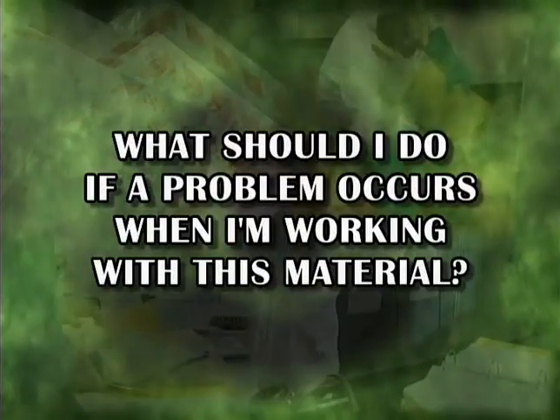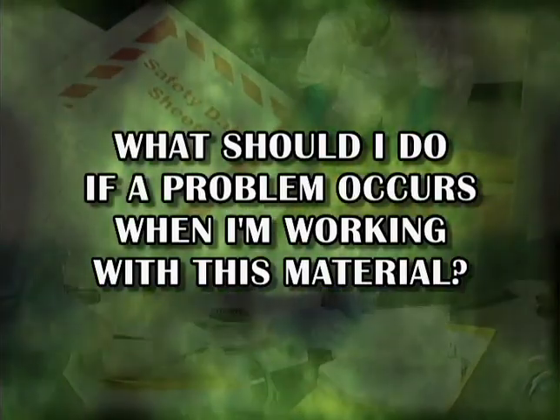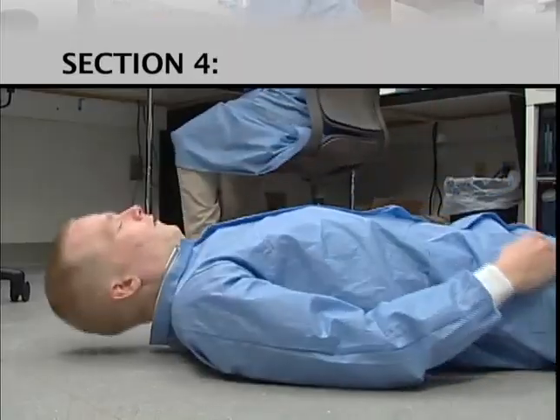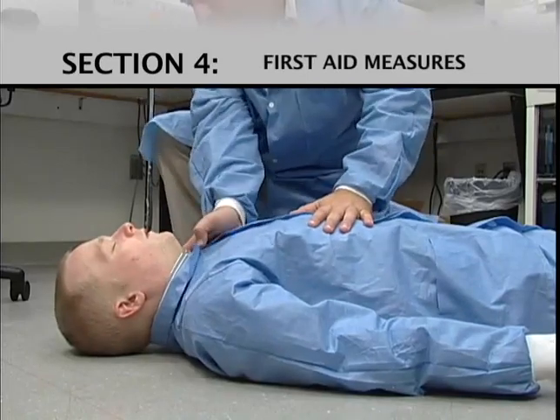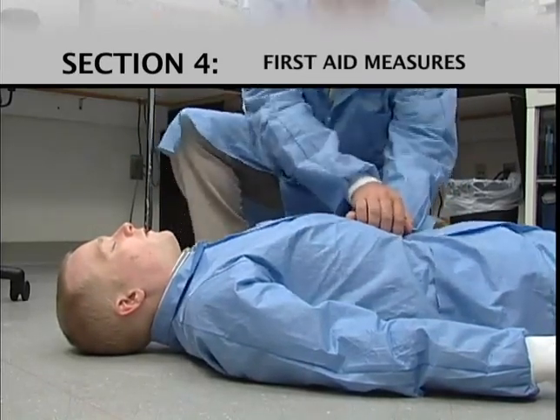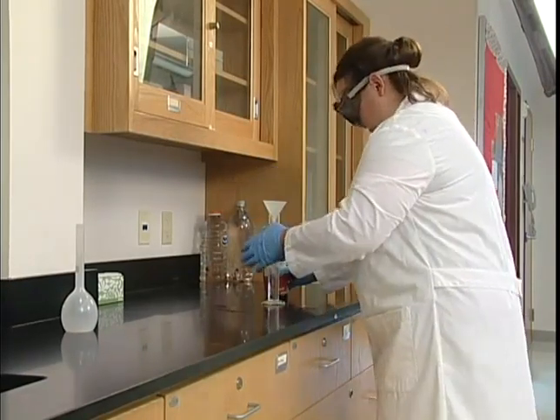The next important question that a safety data sheet answers is, what should I do if a problem occurs when I'm working with this material? Sections 4, 5, and 6 provide this information. Section 4 of the SDS outlines the basic first aid measures that can be used before professional medical assistance is available. Simple instructions are provided based on the chemical's route of exposure.